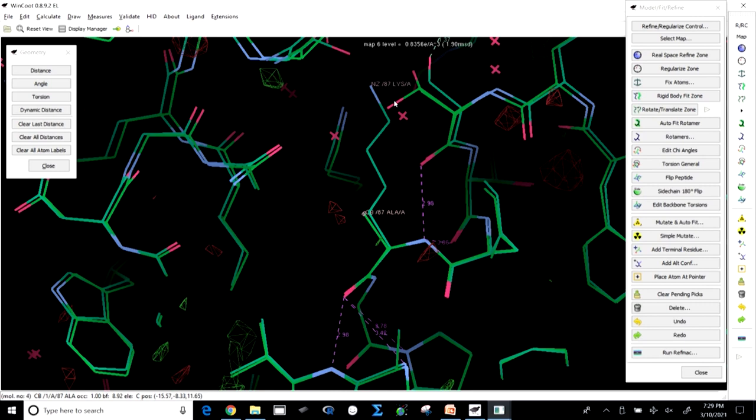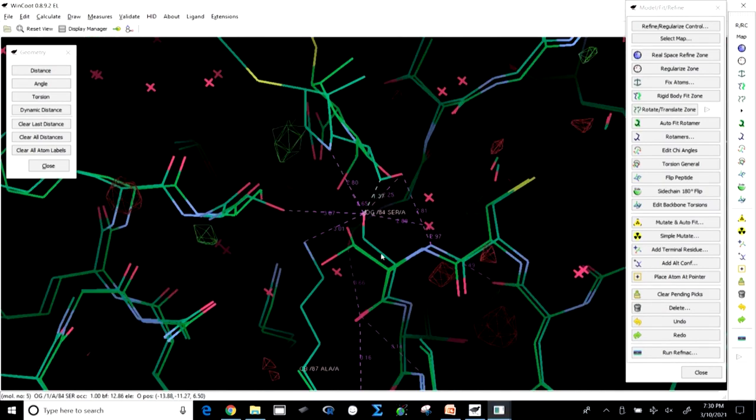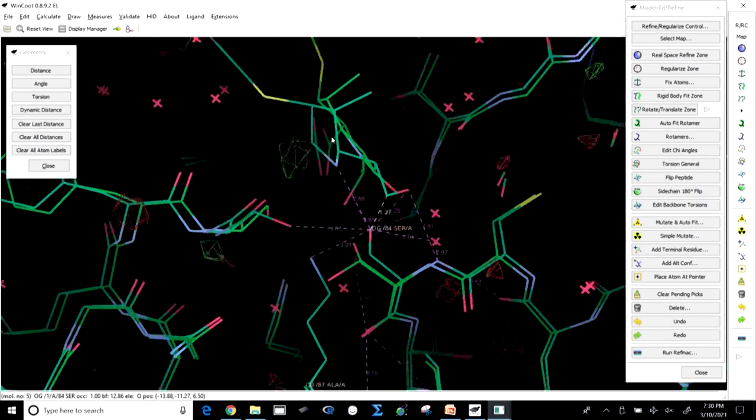changes the conformation of the lysine, which goes and holds the serine in a particular position, and now the serine not only loses the proton, but becomes ready to do the reaction. So, this is not only showing us, but also giving us the mechanism.